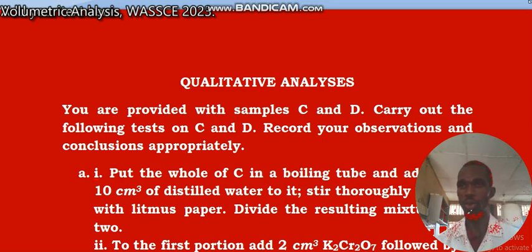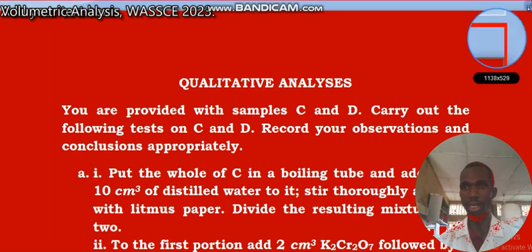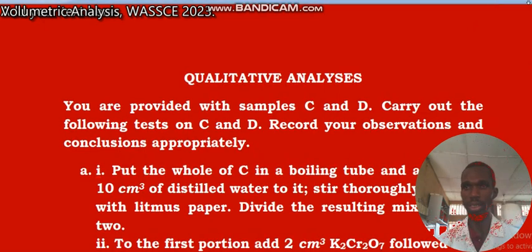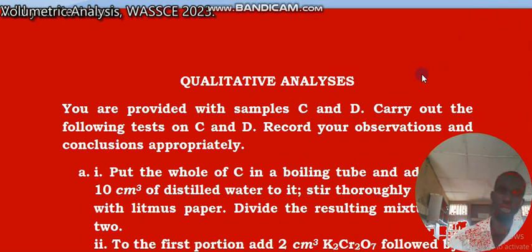I also want to urge you, when you enter the examination hall, ensure you read the questions. The questions must not be as presented here. These questions I'm giving you are just guides, trying to guide you on what to possibly do. Having noted that, we have the question on the screen.